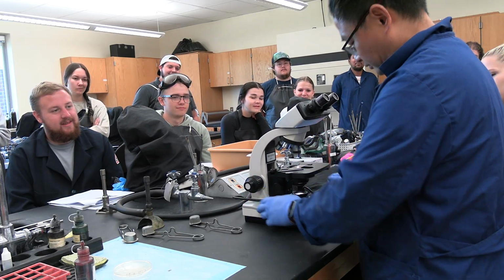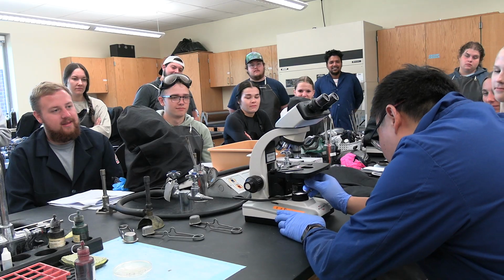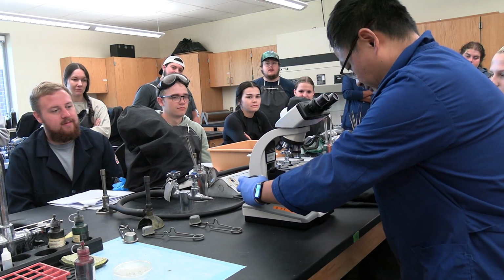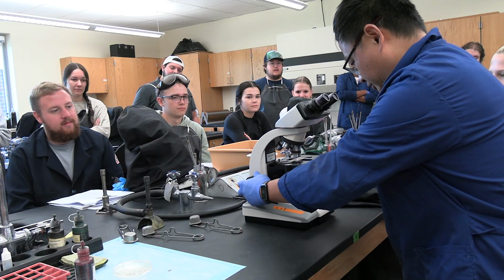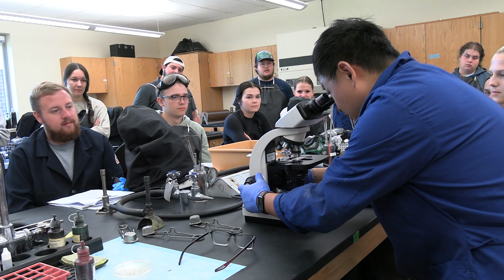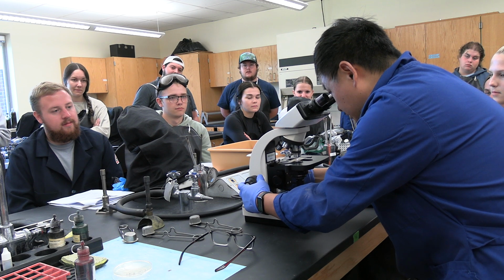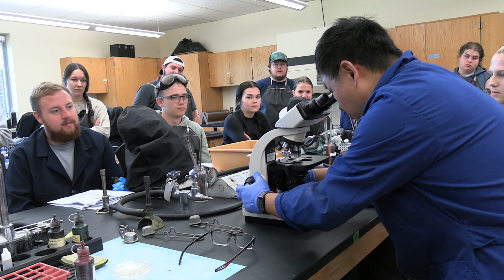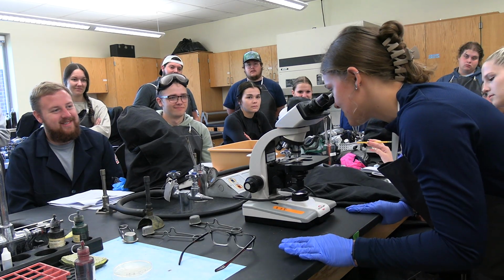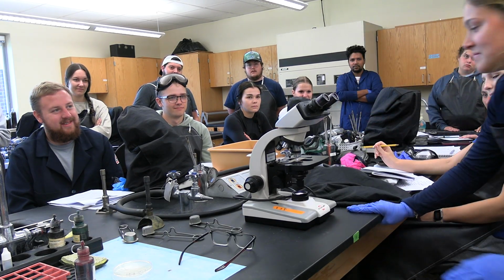10x. Iris diaphragm at 10, make sure. That's all the way at the top. Go up, up, up to the place you cannot touch. Okay, then go down a little bit, go down a little bit. You'll see a lot of things there. See it? Lots. See it?